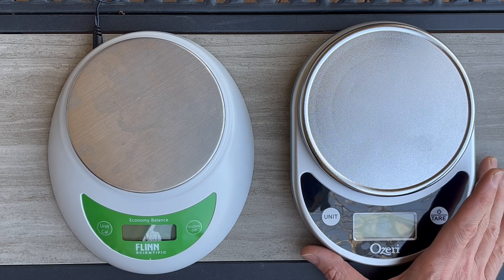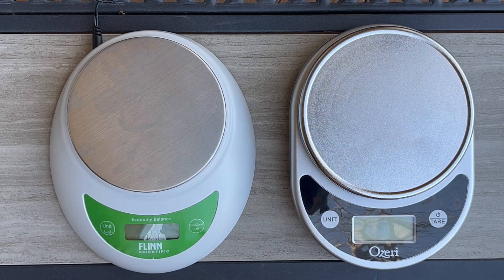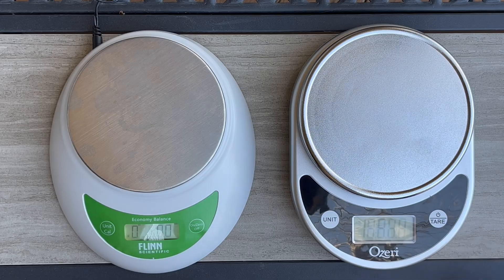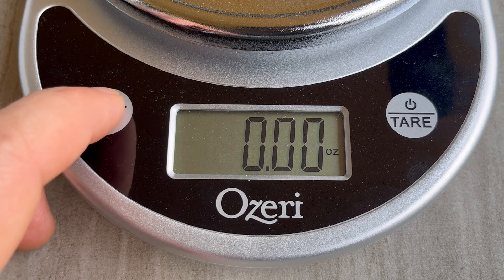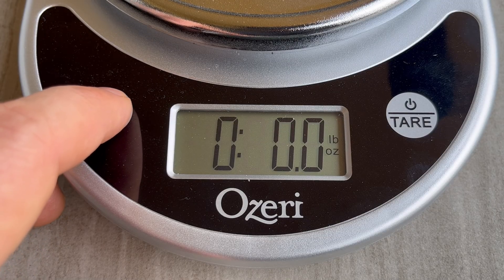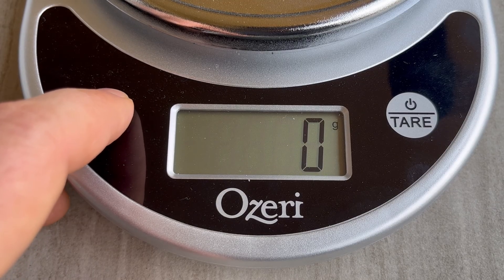The second thing — and this is really important — make sure that you turn the scale on before putting anything on it. Once you've turned on the digital scale, make sure it's reading zero. If for some reason it's not, go ahead and turn it off and turn it back on. Next, you need to select the unit you're going to use.